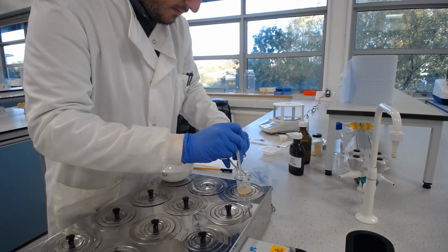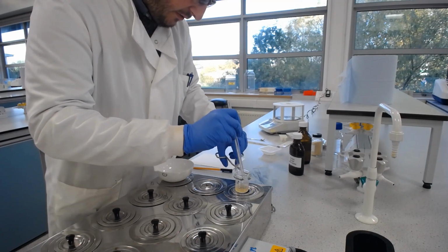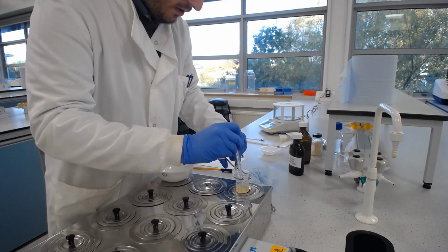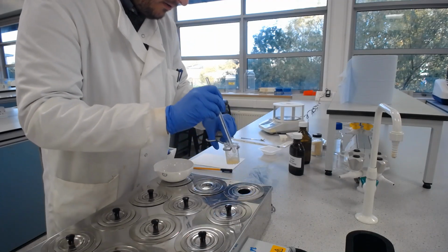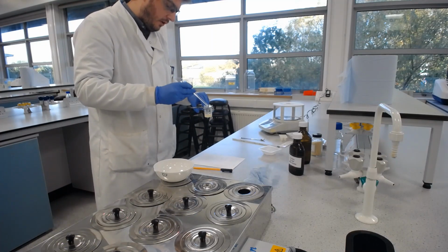So we're nearly there now with this. I've still got some grains just sitting on the side of the beaker where I mixed it too vigorously at the beginning. So don't do that. Do as I say, not as I do. Now I'm just going to also wipe that off there on the side.